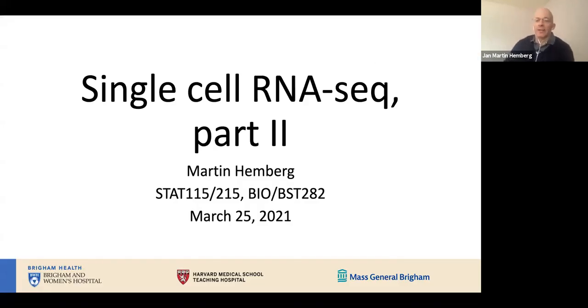Right. So welcome back, everyone, to the second part in this guest lecture series on single-cell RNA-seq analysis. Today I will pretty much pick it up where we left off yesterday. So I'll first be talking about, as we did on Tuesday, how to do some dimensionality reduction, feature selection, and visualization of your single-cell RNA-seq data.